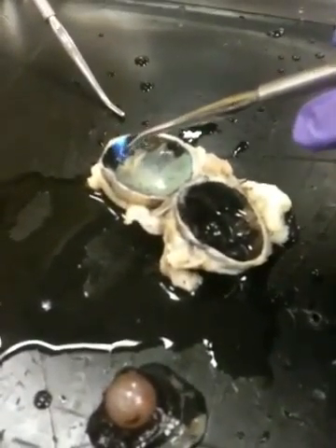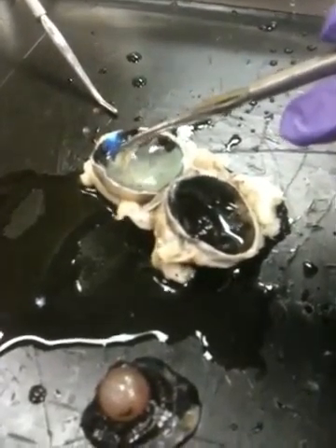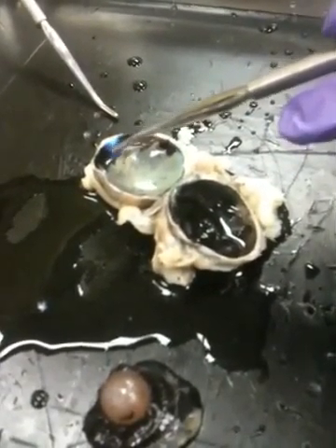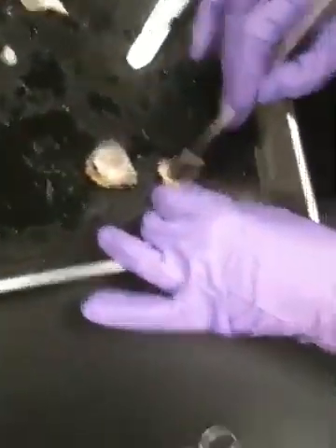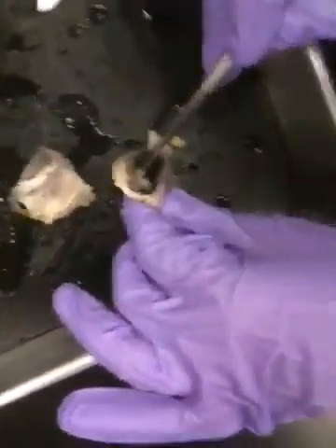I read that it comes from protein interactions with the light, and it may only be there in preserved specimens, so I'm not sure, but it's very pretty. But that's choroid. Then we have, oh, and I just wanted to show you, if we keep pulling off, we can pull off the choroid, you can see the sclera underneath it. See, this is another way to see the sclera real nicely.